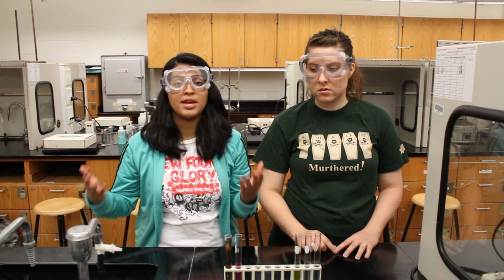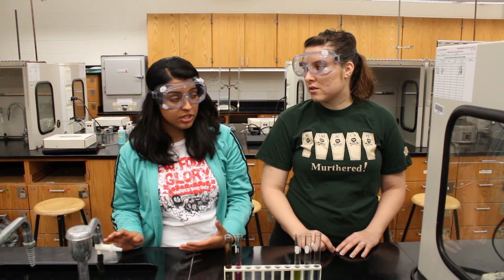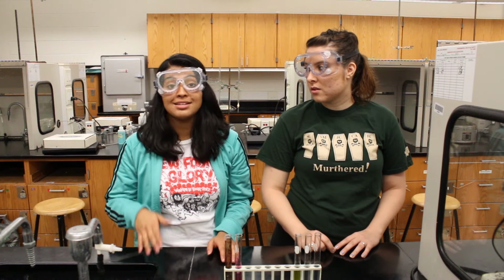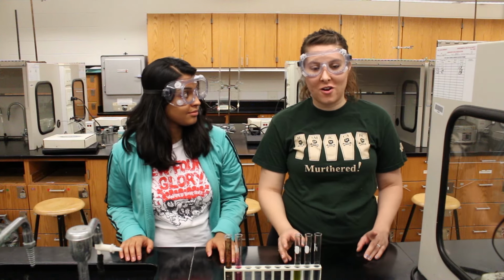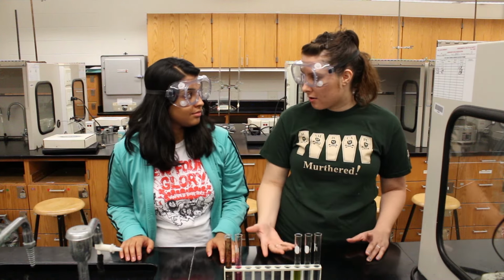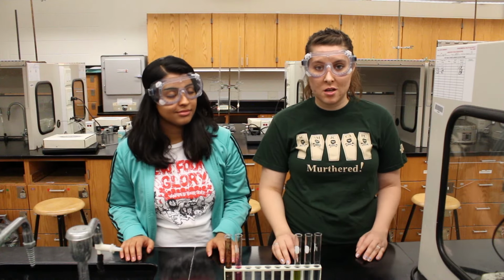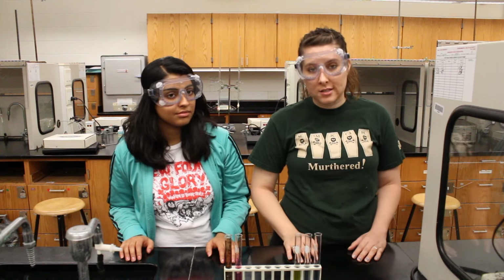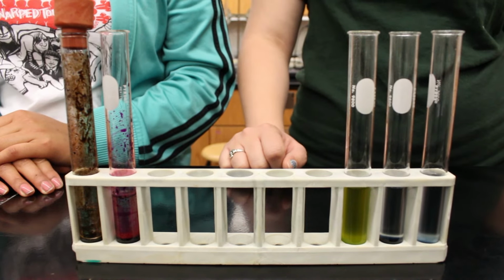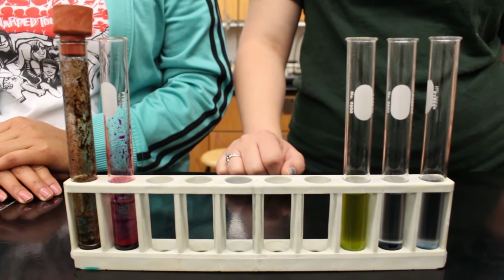During oxidation, a carbon and an oxygen form a double bond. In order to form that double bond, there must be a free hydrogen atom on the hydroxyl group and the adjacent carbon atom. That's right. In a tertiary alcohol, the carbon attached to the hydroxyl group has 3 other carbons attached, so there's no room for the hydrogen. So we'll be able to tell which alcohol is tertiary by whether or not it undergoes oxidation. And we'll also be able to distinguish primary and secondary alcohols because of the different products.